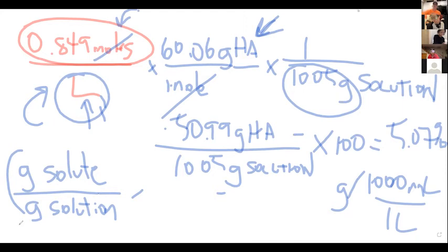Actually, we really only have 1 because it says 1 molar, but I know the concentration is more accurate than that. So I think we could definitely assume that it's at least 1.0 molar. It's probably closer to 1.00 molar, but I don't know that for sure. So 2 significant digits, 5.1%.